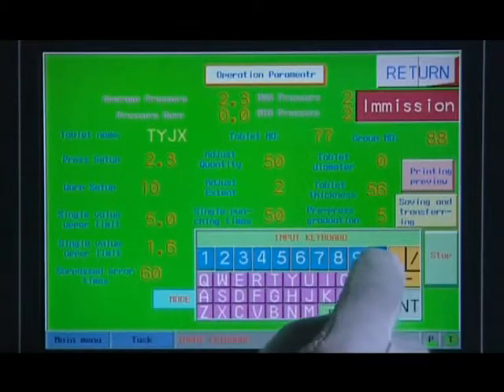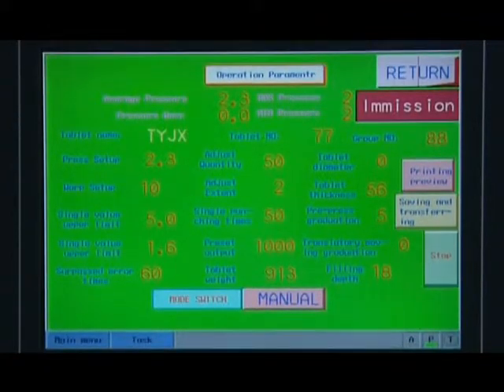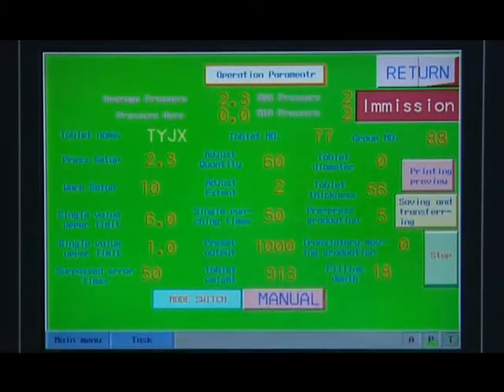Single value upper limit and single value lower limit are also set according to the actual value of max pressure and min pressure. But in principle, the value width is wider than the actual value of max and min pressure. Set standard deviation, running out times, adjusting width, single shot times, etc.